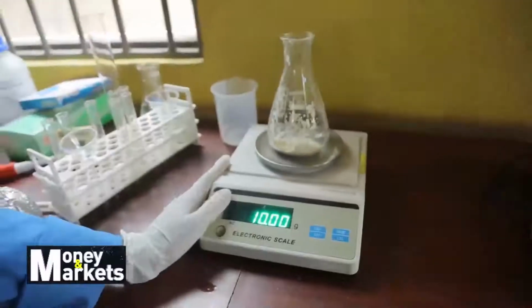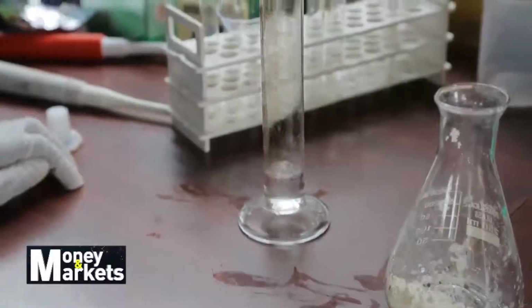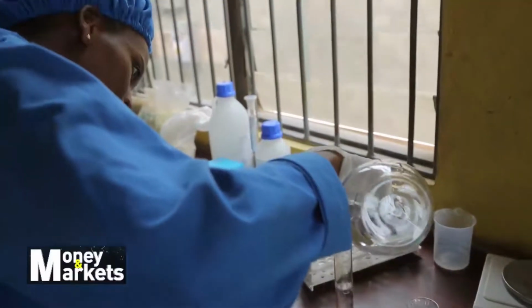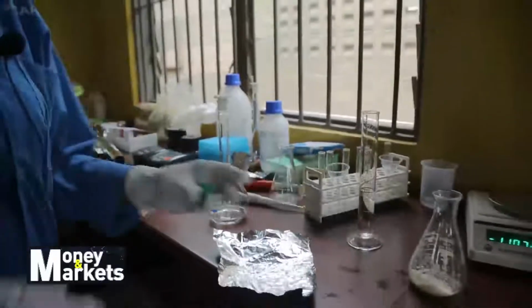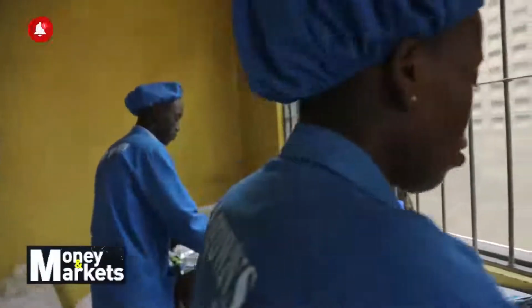After getting your 10 grams of the sample, you use 50 mils of the 65% ethanol. It's the one you're going to use to dissolve this, to mix your sample.